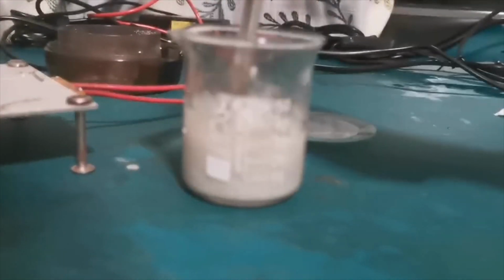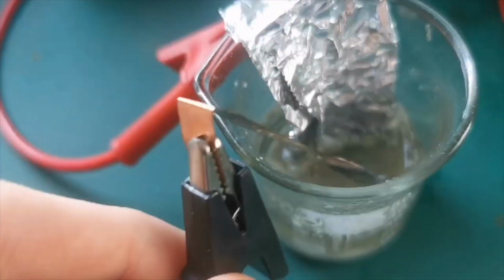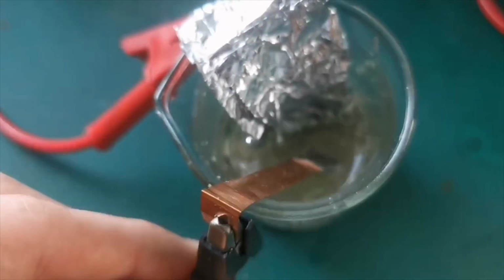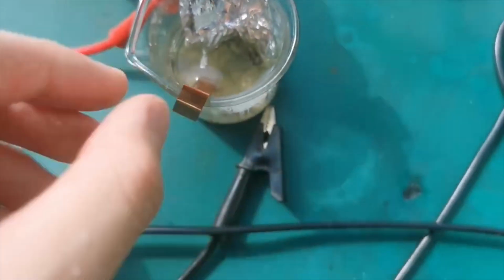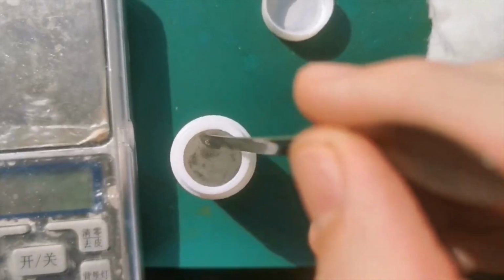I connected the power supply and restarted the electrolysis. 2 days later, a decent amount of lithium deposited on the cathode. I took the cathode out and weighed it. Its mass turns out to be 0.76 grams, which means that around 0.2 grams of lithium was made in the run. I then did my best to scrape off the lithium using a spatula, and this is our yield of lithium metal from roughly 45 hours of electrolysis.